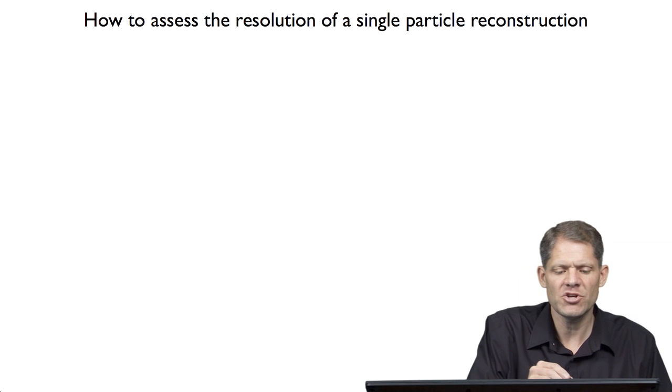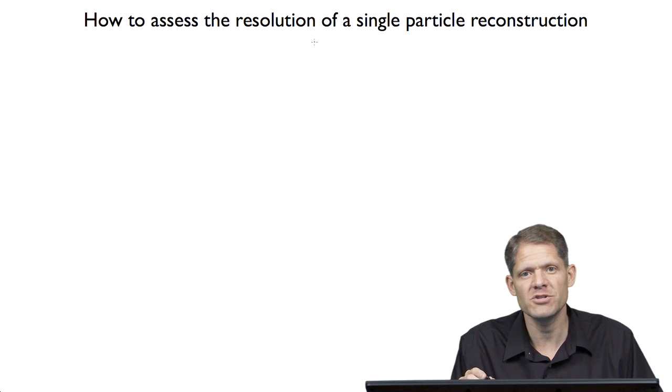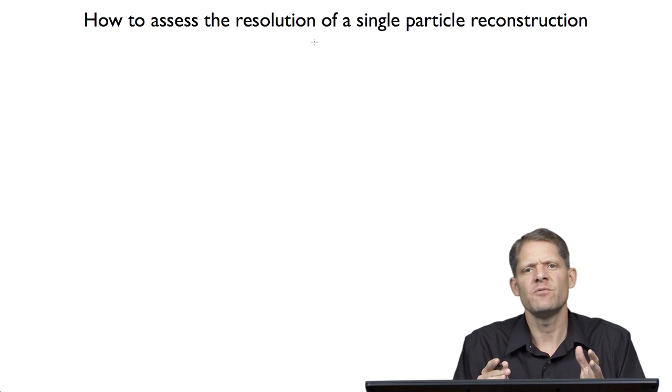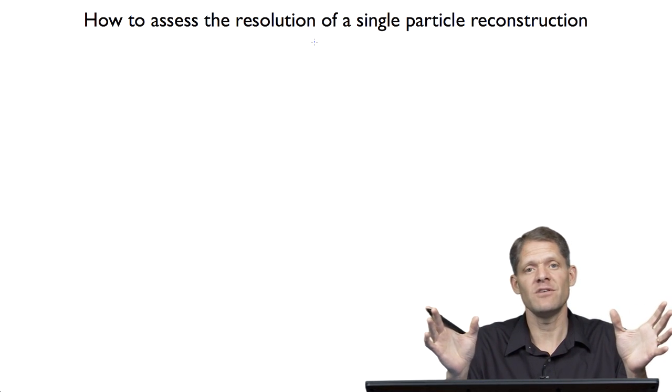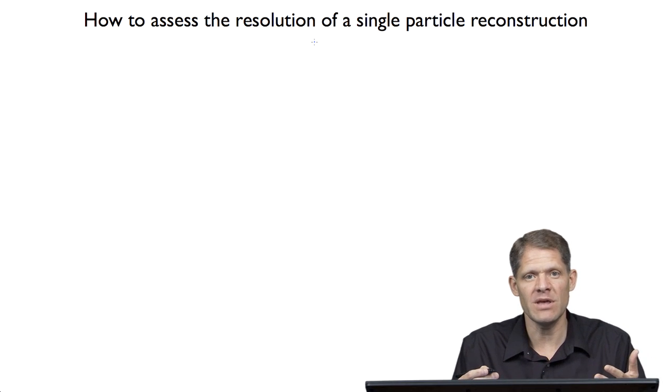And let's start with the question of how to assess the resolution of a single particle reconstruction. The basic answer is that we'll do the experiment twice and simply compare the results as a function of spatial frequency. How well do they match?